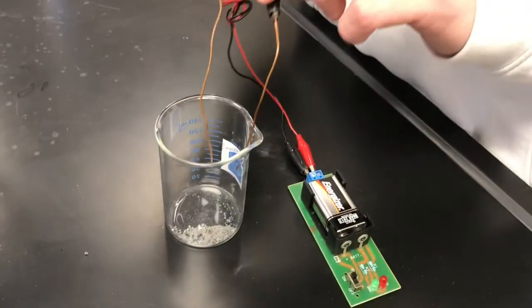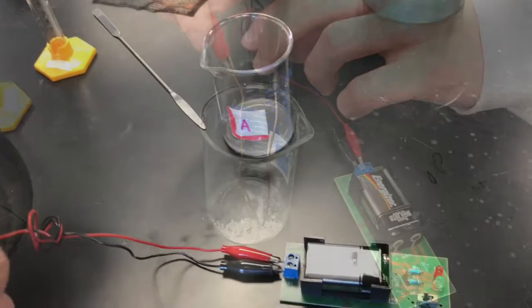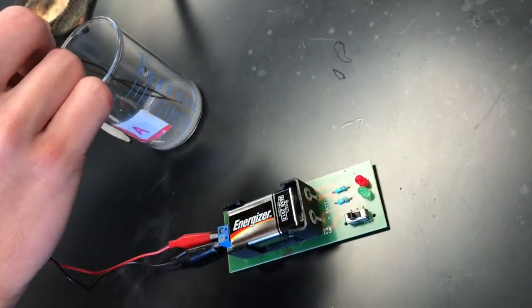As you can see, the product of magnesium reacting with air when heated created a non-malleable, ashy, dull powder. The product is also not conductive when dry, and is also conductive when wet.